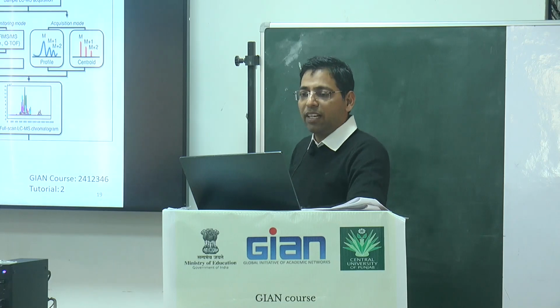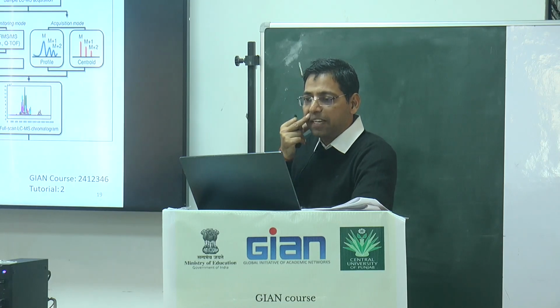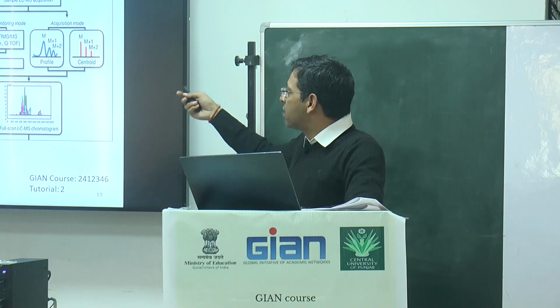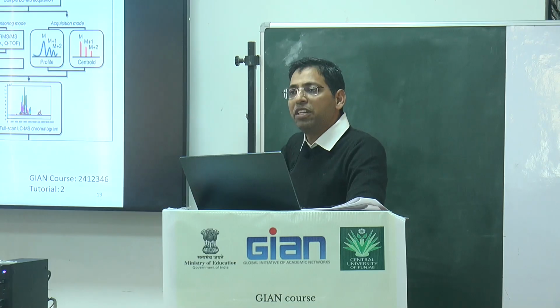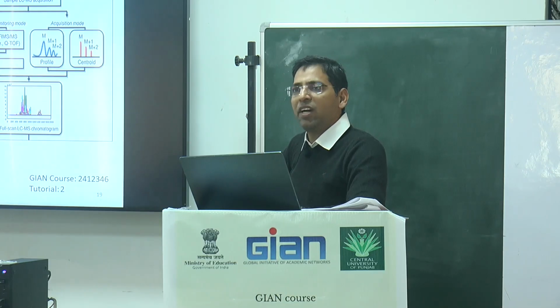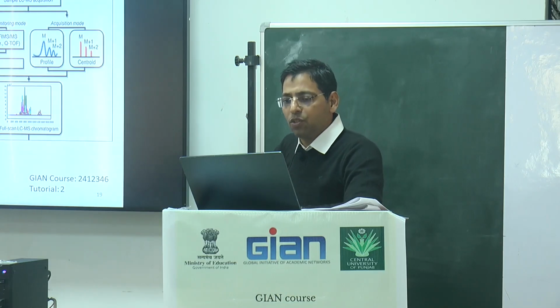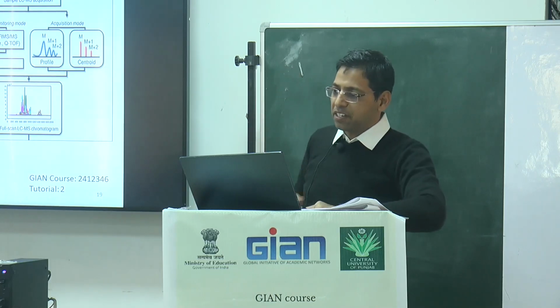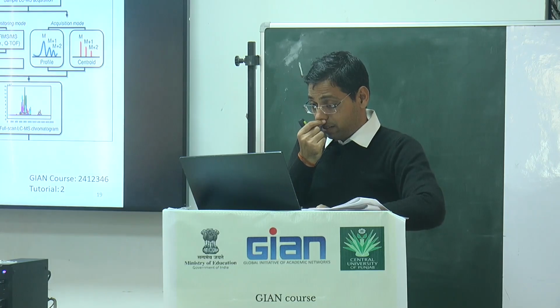So I'm coming to data acquisition here. This is the same thing that I told you; there is a little bit of difference, but it is almost the same. And yes, profile and centroid, so you have to decide which one to go ahead with. Profile is the most recommended, but centroid is used in some specific conditions only. Data storage and conversion is a very important step.